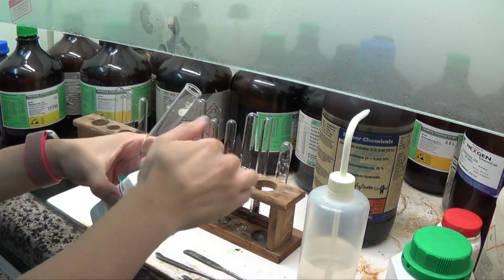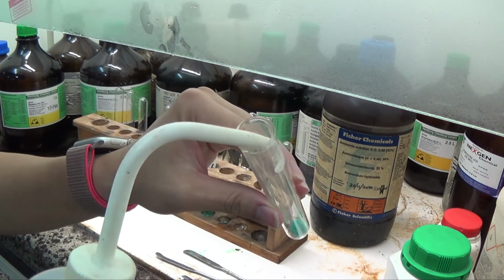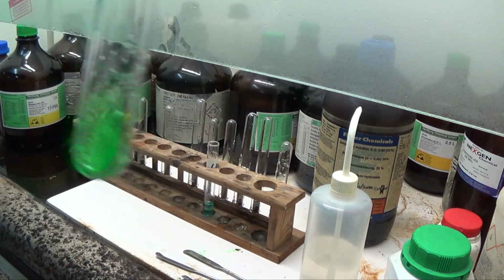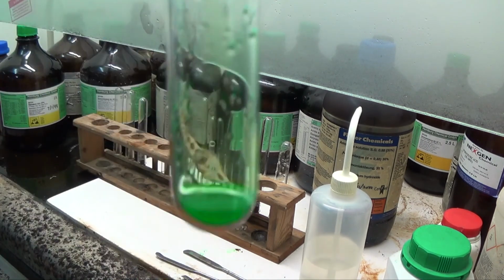I'll just add a very small amount of water and see what the color is. Can you see the color? So this is the same compound. In the very small amount of water, it is green.